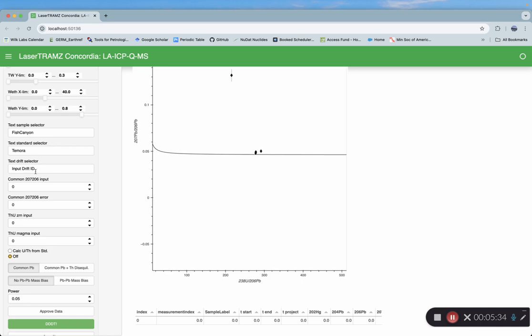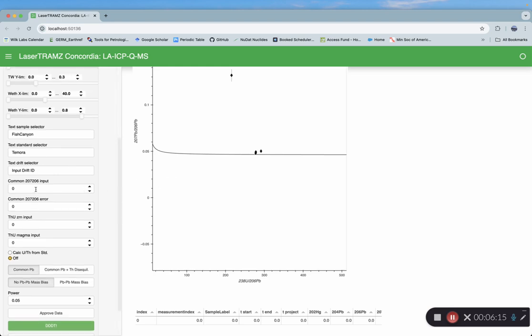Our laser particularly has this active energy laser management selection, where the laser recalibrates its output energy as time goes on. So the drift, typically you'll see the analyses drift a little bit, and then they come down, and then they drift, and they come down, or then they come down and back up, etc. Okay. And there's really not too much drift that I've noticed in the iCap for these analyses. Certainly not within error of the analyses overall. Yeah, that's going to be really different in the multi-collector version of this program.